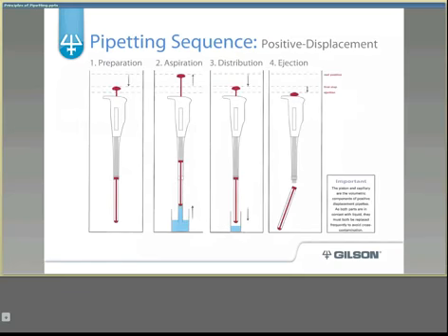The pipetting sequence for positive displacement pipettes involves four steps. For preparation, press the plunger button to the first stop and the piston will move to the appropriate position. For aspiration, immerse the CP in the liquid and release the plunger, letting it move up to the home position. For distribution, press the plunger button to the first stop and the piston will move down and expel the liquid out of the capillary. For ejection, press the plunger button all the way down to the second stop; the capillary and piston are ejected without hand contact.